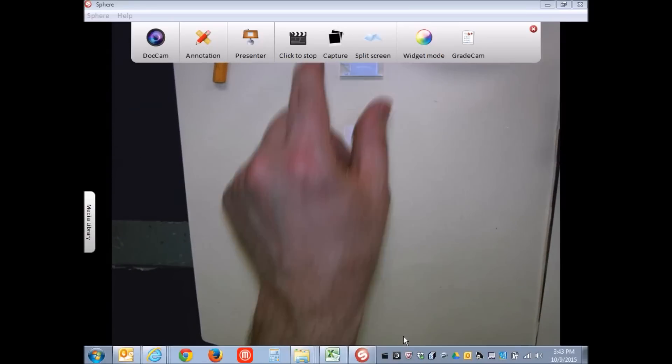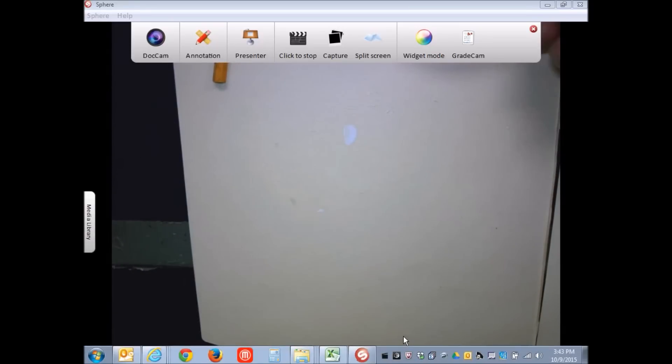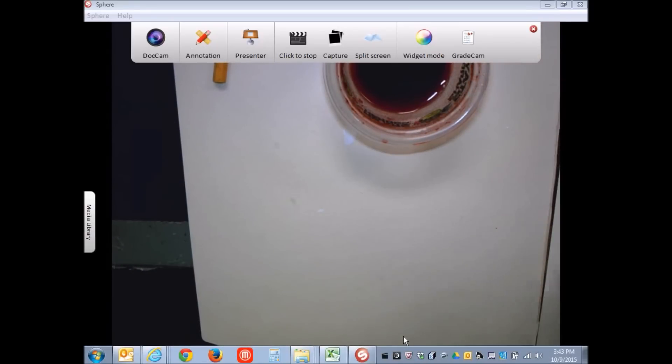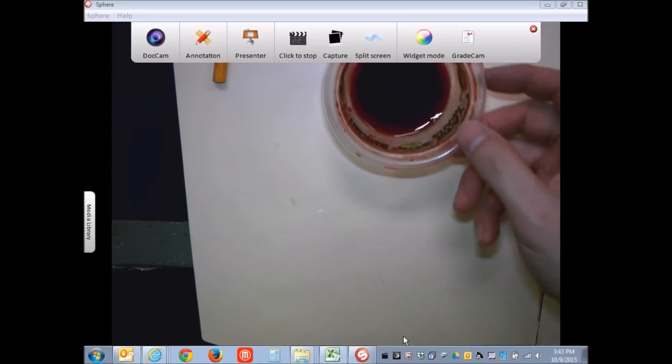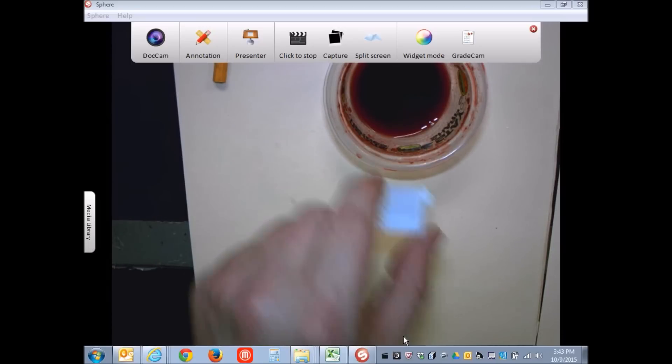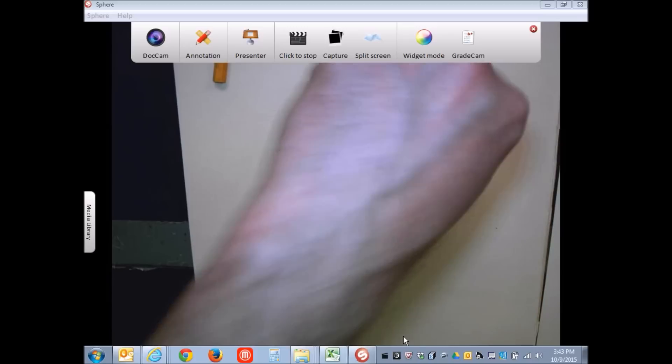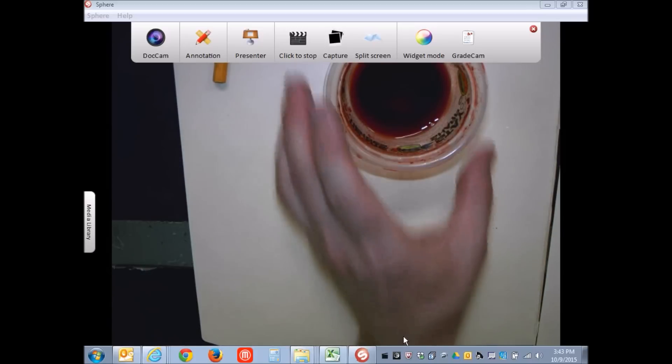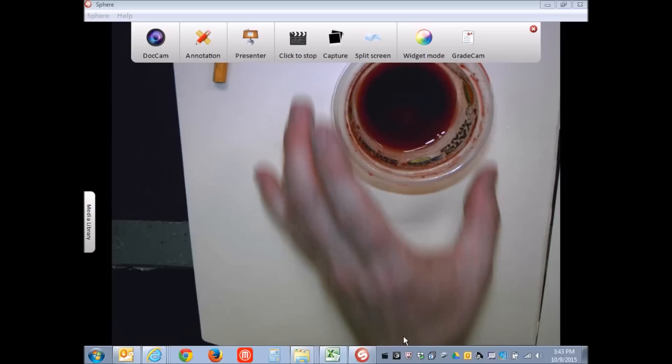Once the slide is done, you can place it in the blackberry juice and let it sit for a specified amount of time. I put it in there upside down to make sure the dye gets nice and coated.